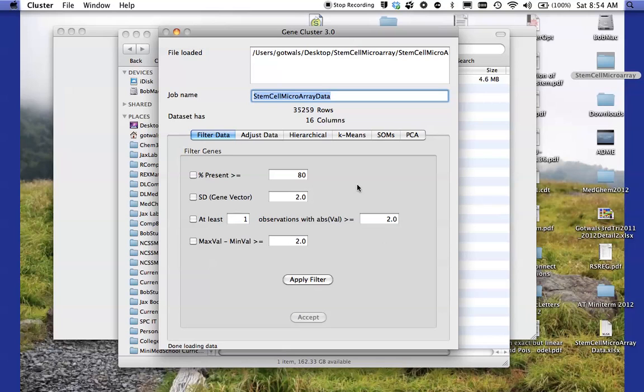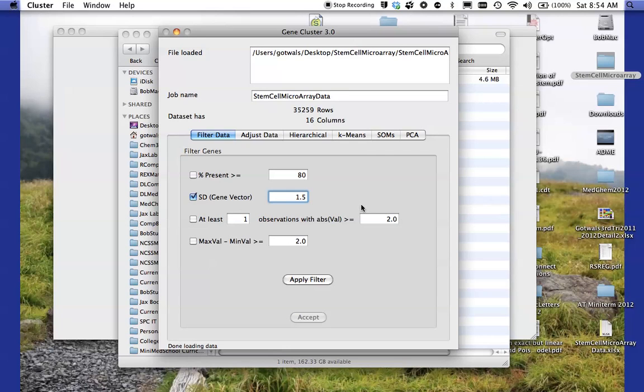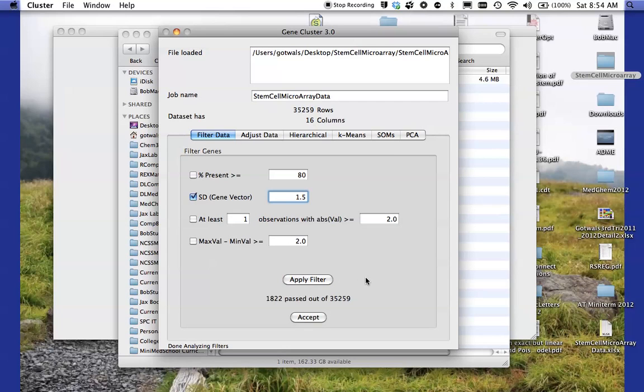So I'm going to eliminate all of those genes that don't change very much. So I'm going to click on standard deviation gene vector and I'm going to type in a 1.5 there. And what that means is it's going to eliminate all those genes that have a standard deviation of 1.5 or less. So again, I'm eliminating those genes that aren't very variable over the 14 cell types. I'm going to click on apply filter and notice that it says 1,800 genes out of 35,000 have passed. That means there's only 1,800 genes in this data set that are changing significantly across the 14 different cell types.